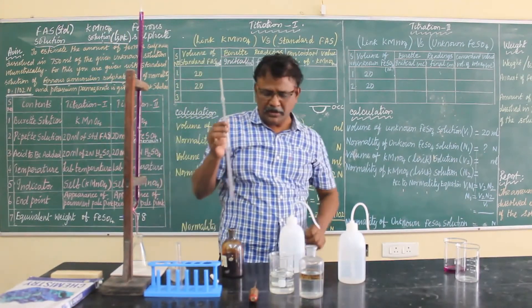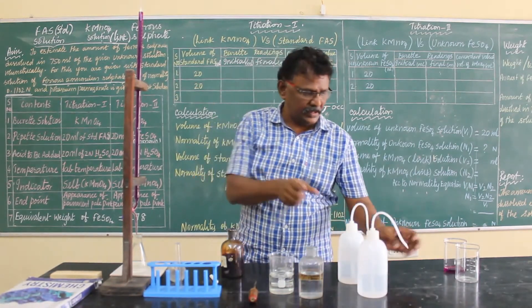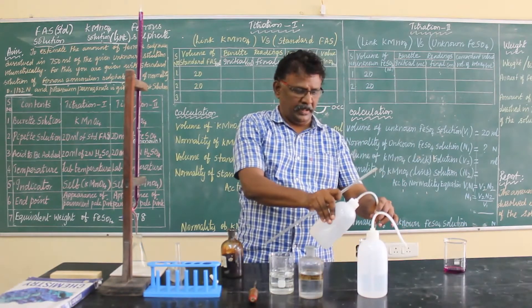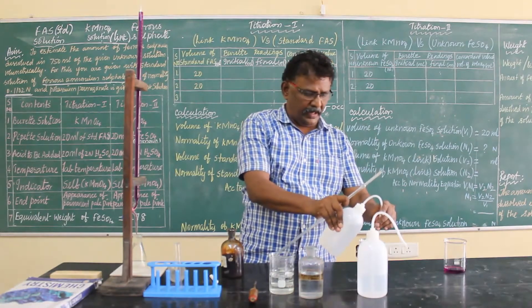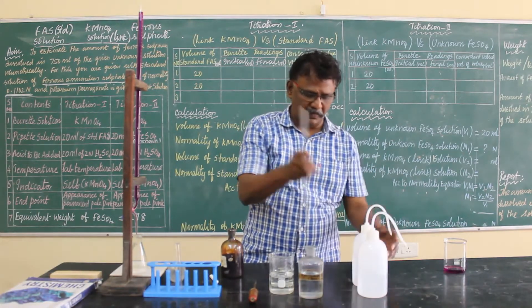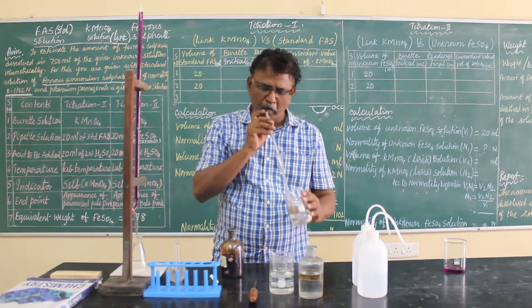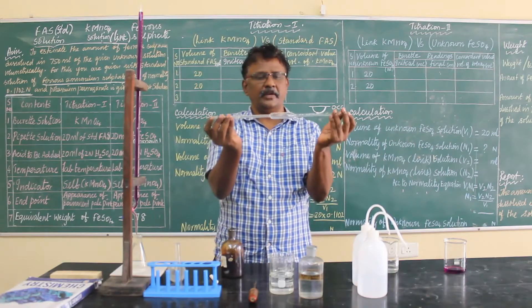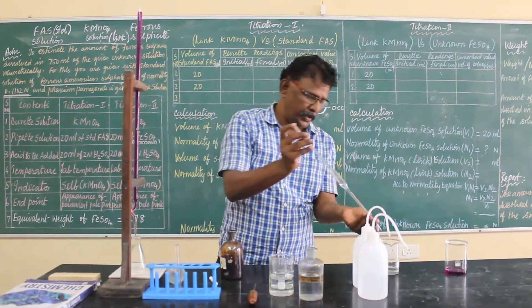The rinsing pattern of the solution is very, very important. First, you have to rinse with water the same way you rinse the burette with the burette solution — potassium permanganate. Take some water, tilt it, rotate it, and pour it out in the sink.